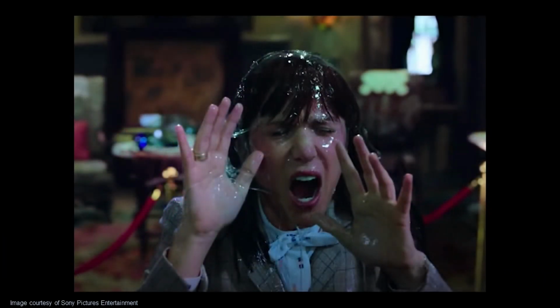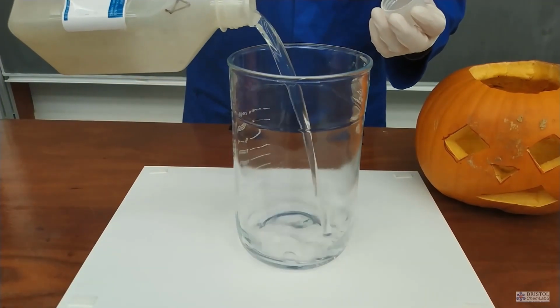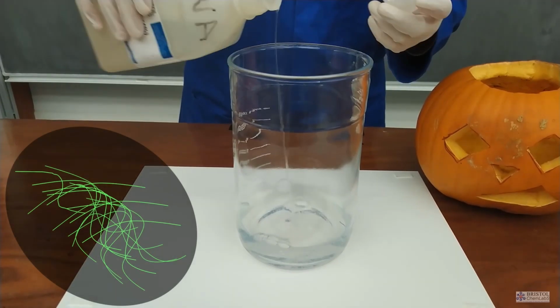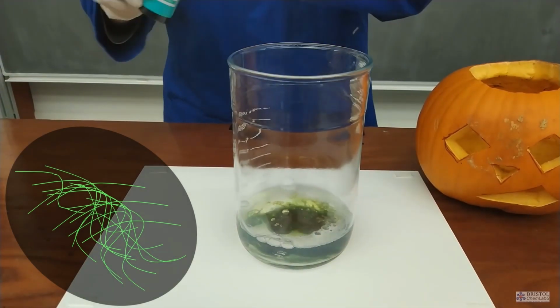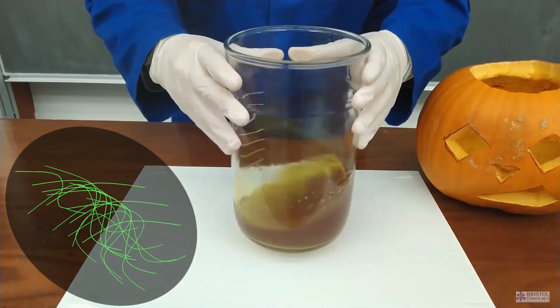The production crew made up a huge vat of slime to film this scene, and this was connected via a hose with a pump to create that jet of slime. The main ingredient in this slime is tapioca. In the chemistry lab, we can make slime by using a soluble polymer, polyvinyl alcohol, or PVA. This consists of long-chain molecules with many alcohol groups along the backbone. It's soluble and it flows well, as you can see as I swirl it with food colouring.